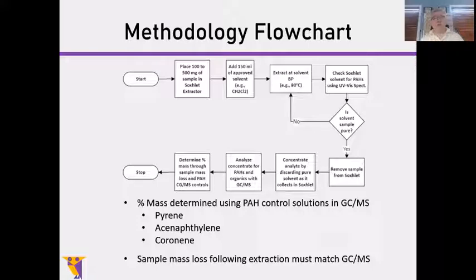And you then are going to use a standard piece of equipment, a gas chromatograph mass spectrometer, GCMS, and by putting in some control solutions of known concentrations, it's easy to determine the response of the instrument and be able to determine the quantities actually present in the solution being analyzed.